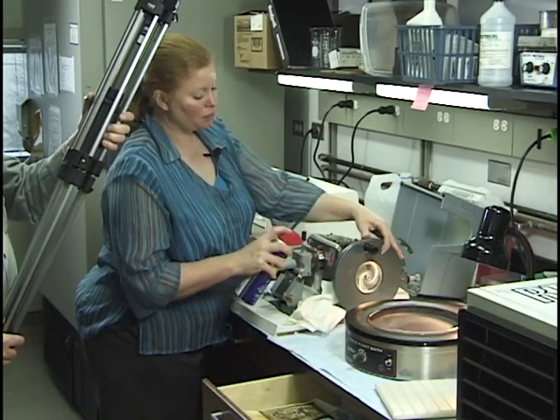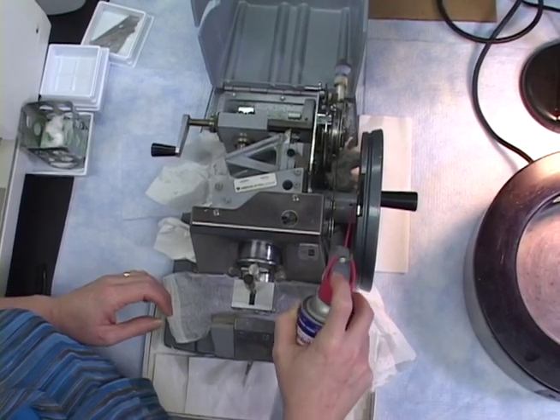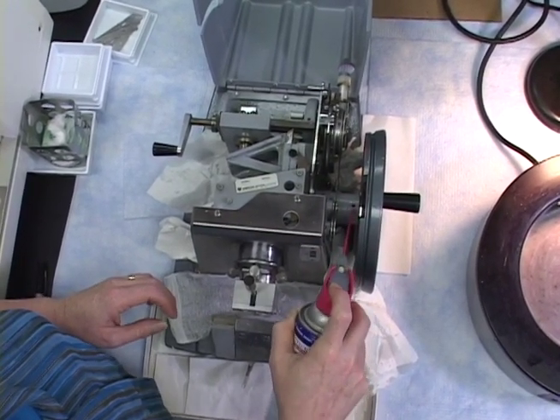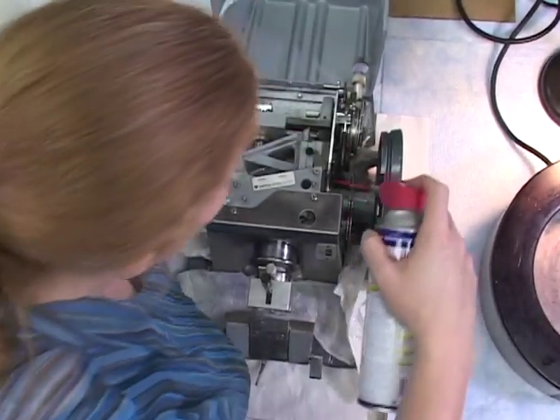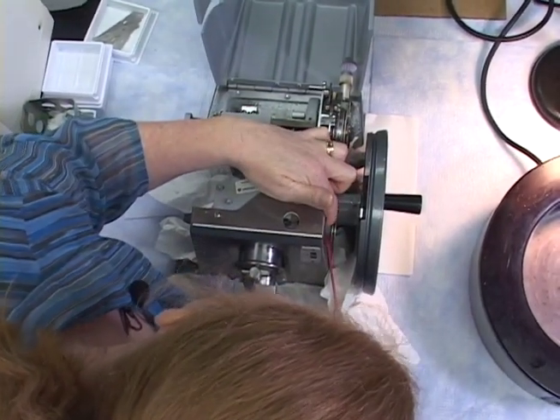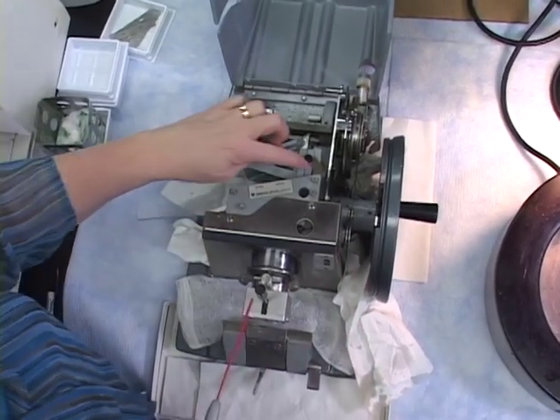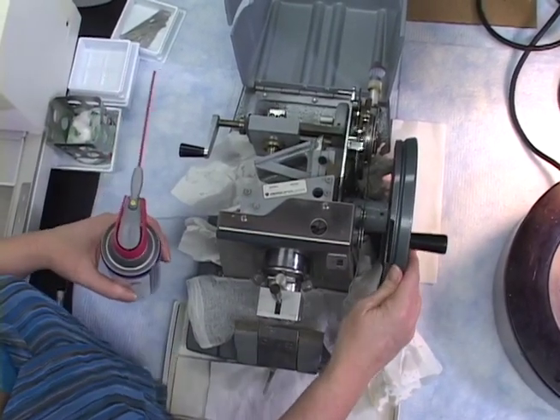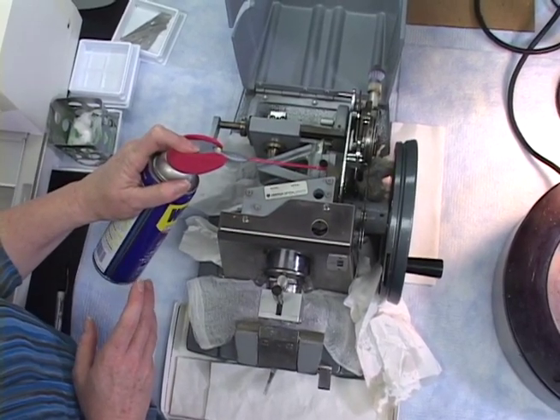I see that this is moving, so I'm going to give it a squirt even though it's outside the hole. And I give a squirt in there. There's a hidden hole back here. There's a little hole right here. This is a slide. When it goes up and down, you can see that this slides along this smooth area here. I give that a little squirt.